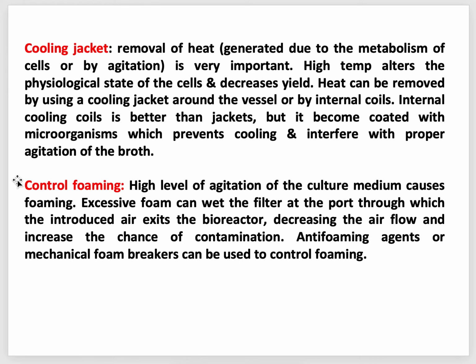Okay, foaming control. Foam is a problem, especially when you use a high level of agitation, because more foam will be produced. Excessive foam can create various problems, such as wetting the filter at the port through which the introduced air exits the bioreactor.